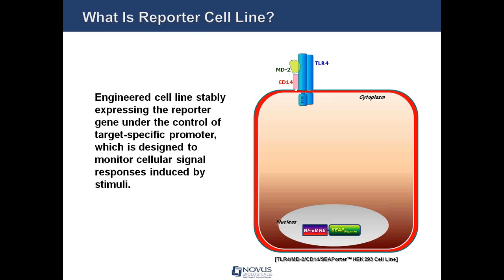A reporter cell line is an engineered cell line stably expressing the reporter gene under the control of a target-specific promoter, which is designed to monitor cellular signal responses induced by stimuli.